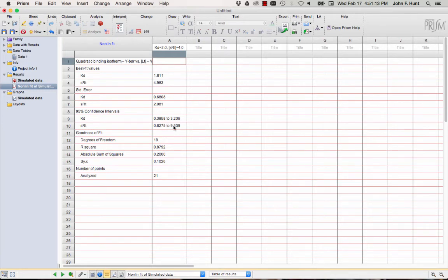So there we go. We know what the answers should be. We're actually getting reasonably close answers. They're not so far off, but our confidence in those answers is not so good. The 95% confidence limits with a data acquisition strategy like that, and with an experimental setup like we have, acquiring data with that much noise, we have a very high degree of uncertainty in these parameters. Okay, and that's, again, the scientific moral of this story.